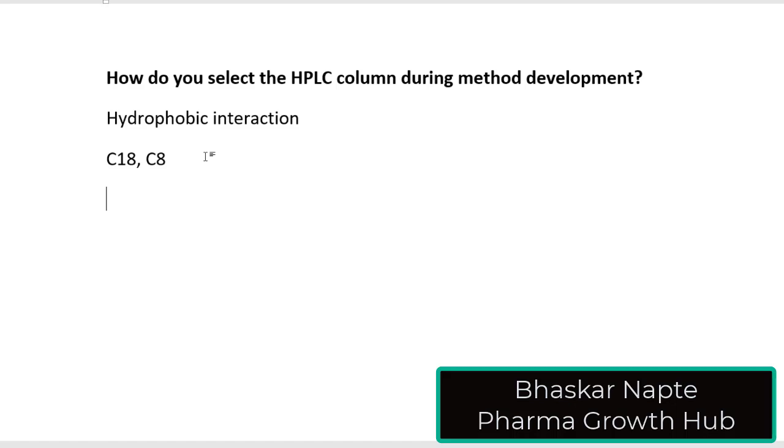So, how can you begin the discussion? In case my molecule contains a functional group, for example a carbonyl functional group, which contains C double bond O, I can take advantage of the carbonyl group because oxygen is a highly electronegative atom, and this oxygen is going to pull the electron cloud towards itself. Because of that, the oxygen will develop a slight minus delta charge, and that makes the carbon carry a slight plus delta charge. So there is a formation of a dipole.